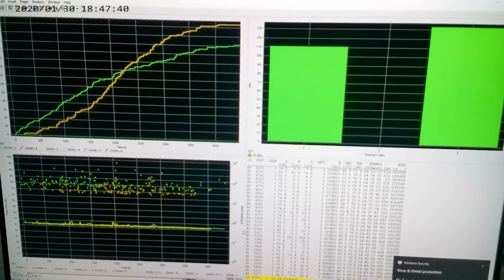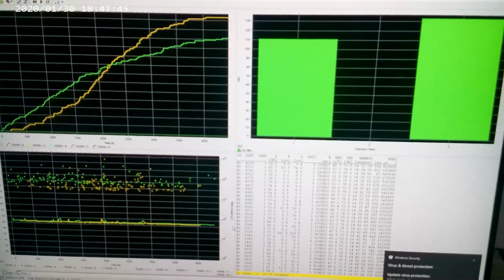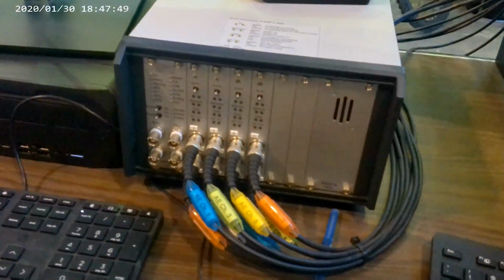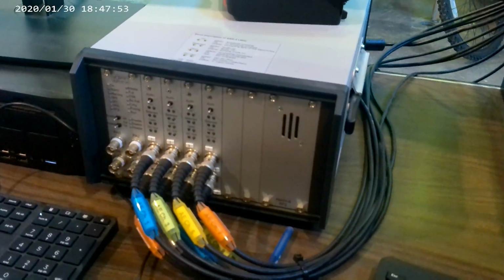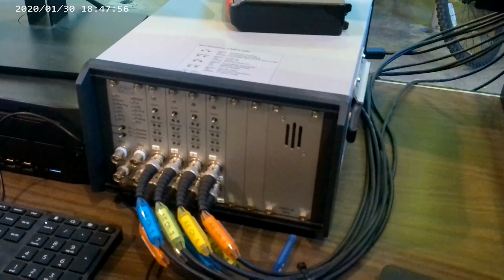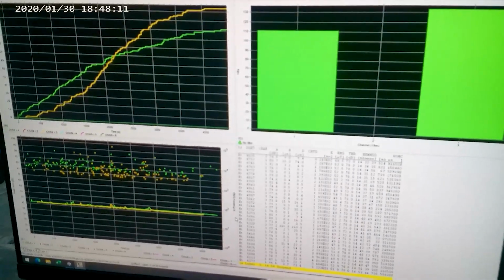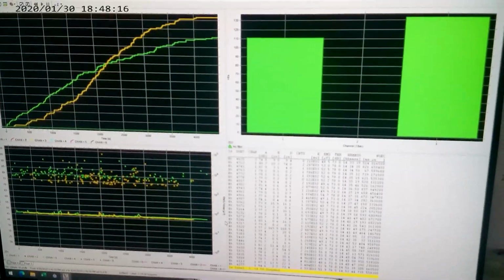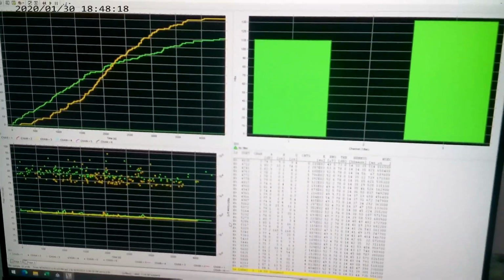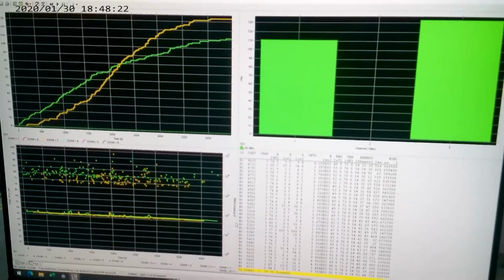Acoustic emissions can be detected and located as a result of the initiation and propagation of microcracks at elevated stresses. The location of an acoustic emission source is determined by analyzing the arrival time differences. Acoustic emission events occur not only as the external stress changes, but are also generated by fluid flow, rock-fluid chemical interaction, and phase changes. This is useful to track the real-time processes under study in the specimen.